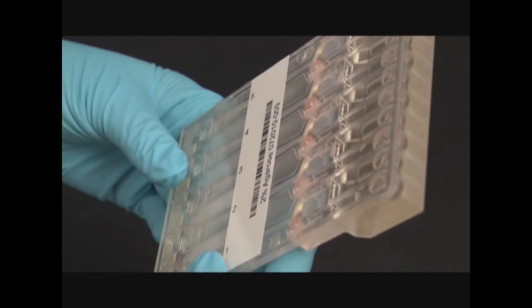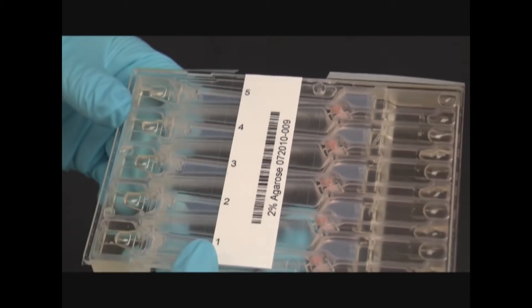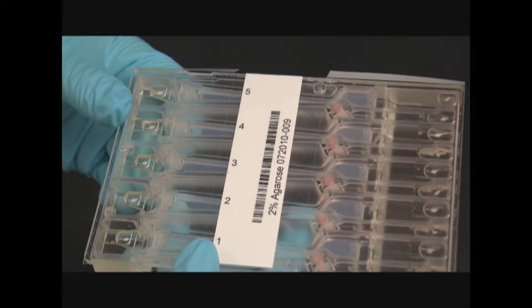Tilt the cassette down on the side of the sample wells to dislodge any bubbles trapped behind the elution wells.